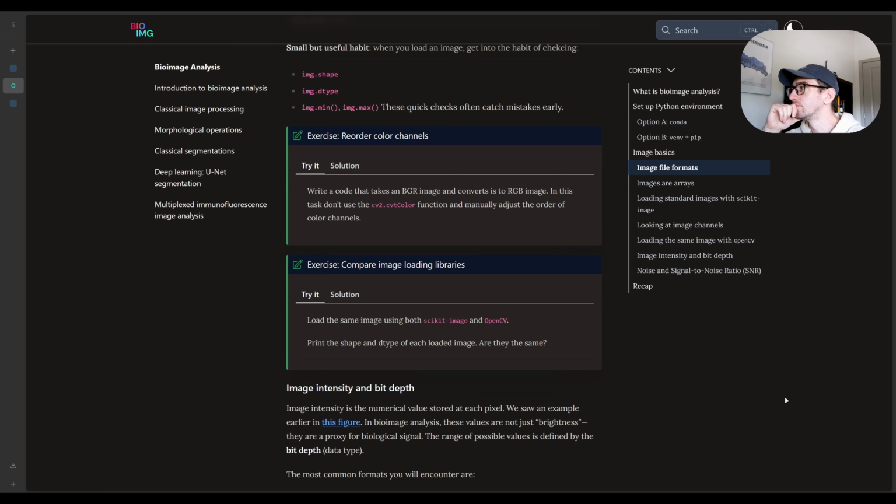I rearranged the color columns, like just reversed them, because RGB and BGR are reversed. Okay, so sounds good. So you noticed that RGB and BGR are kind of similar, but the order is different. It's inversed. And do you guys remember, in terms of slicing, if it's just a one-dimensional array, how can we read it from back to beginning? Skip -1. Yep.